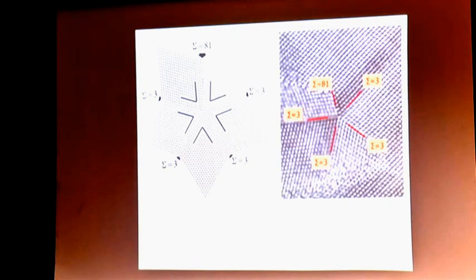It's a mirror boundary. Look here. Look at this line of atoms here. Now, in the next crystal, here it is. So the border marked in red really is a mirror. This is reflected here, and this is reflected here, and this is reflected here, and so on and so forth. So, forget about the sigma notation, it's not important now. Here is a drawing of the same thing. These are called twin boundaries.